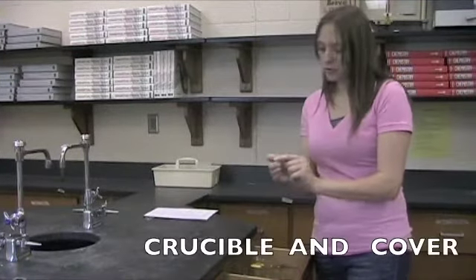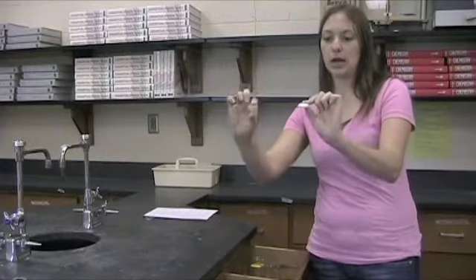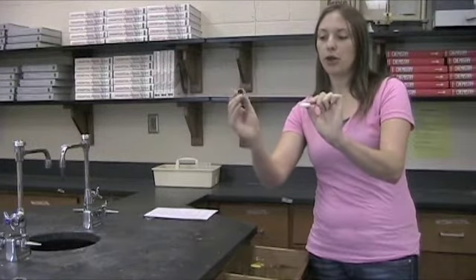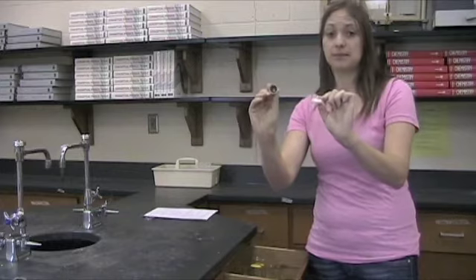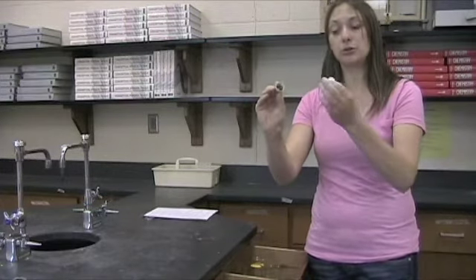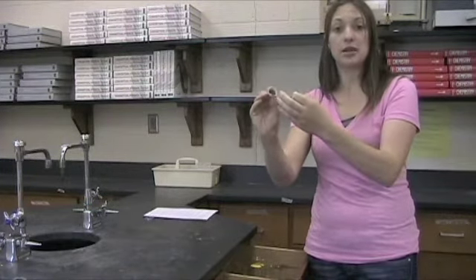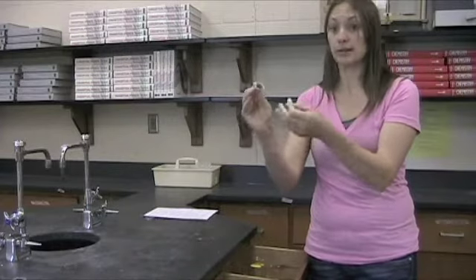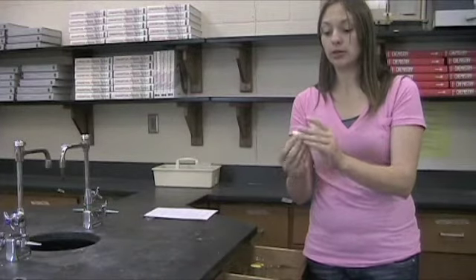Now we have a crucible and it's covered. These are little bitty guys. What they are used for is to heat. You put them over a Bunsen burner and you can put your substance in there and you can get this very, very hot, because it is ceramic. The lid goes on top there.